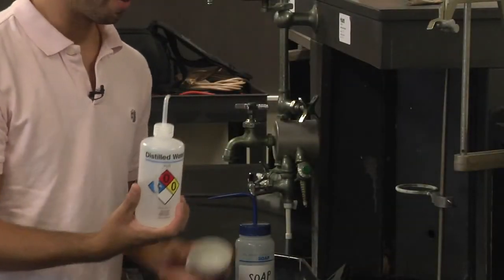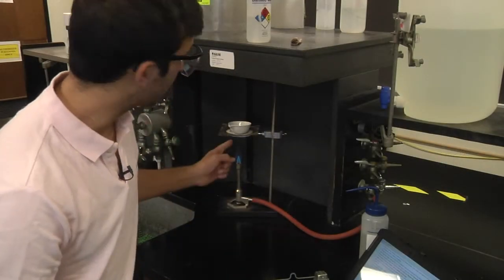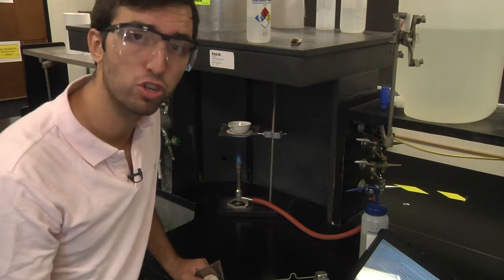Rinse with distilled water and a paper towel. On a wire gauze, heat the casserole on a low flame until it is completely dry. Then repeat the process to ensure dryness.